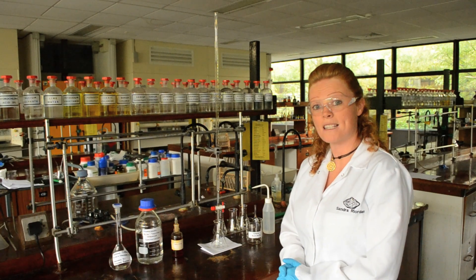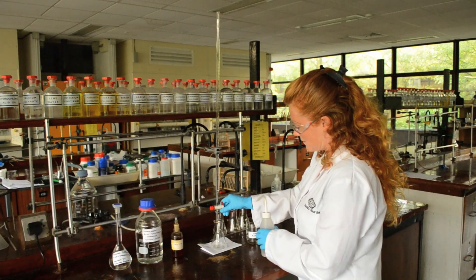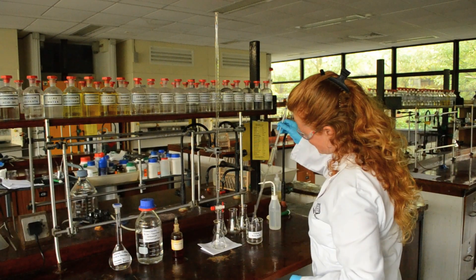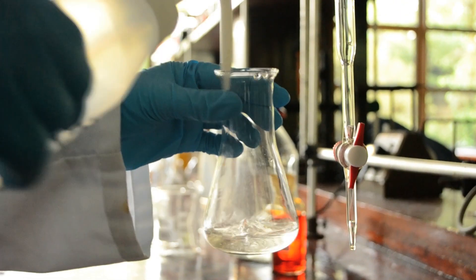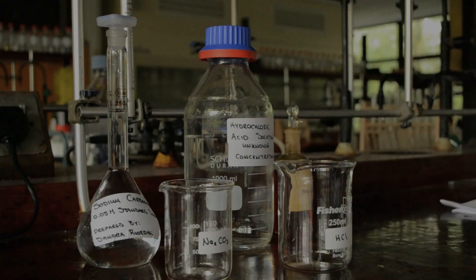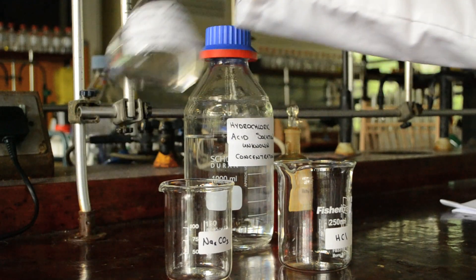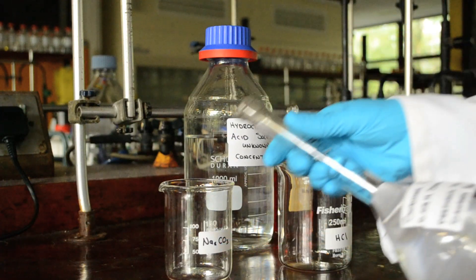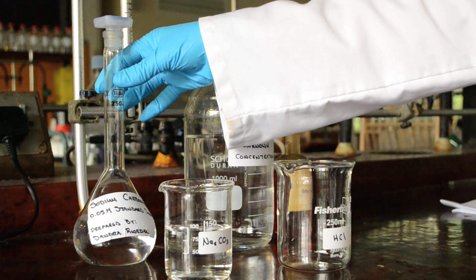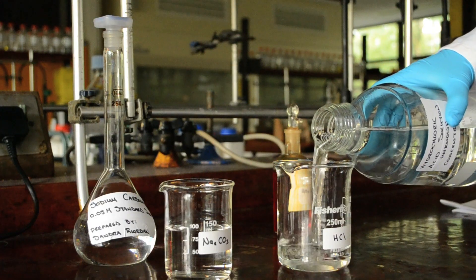I'll start the titration by rinsing all the glassware we need first with deionized water. I'm going to take about 100ml of my sodium carbonate standard solution and pour it into a clean, dry beaker which I've already labelled sodium carbonate. The reason for this is so that I don't contaminate my stock standard solution of sodium carbonate. I will do the same with the hydrochloric acid solution — pour roughly 100ml into this beaker.